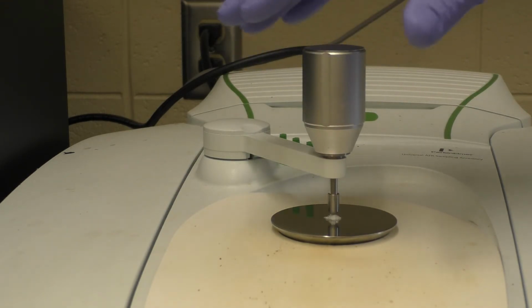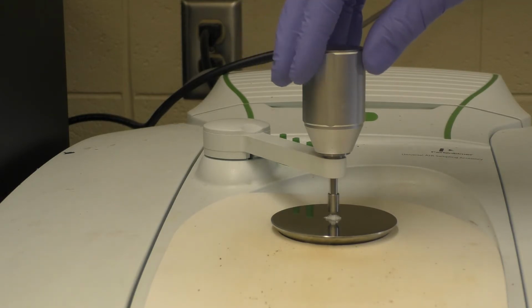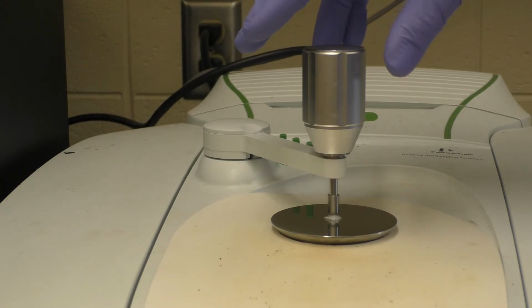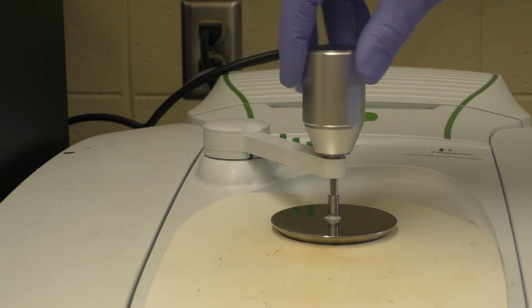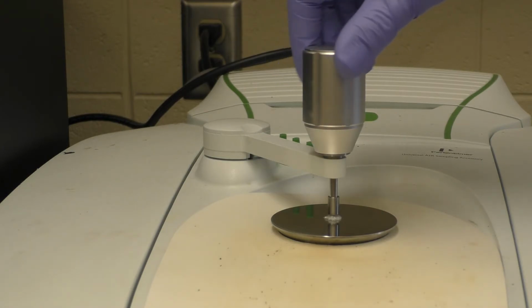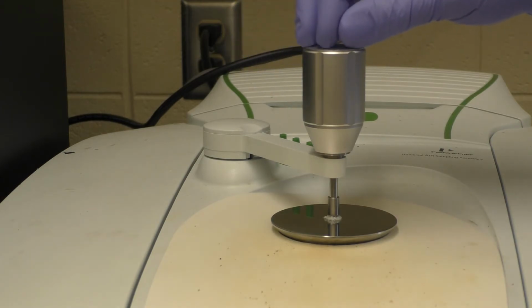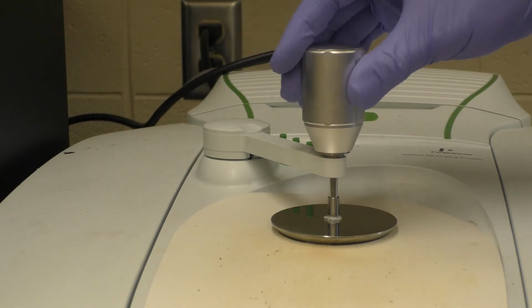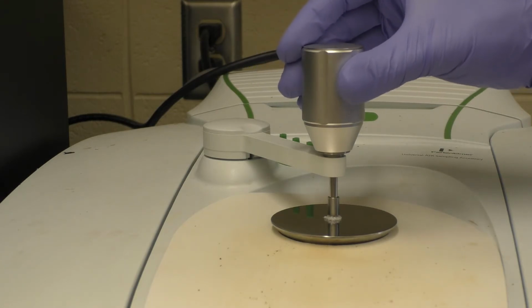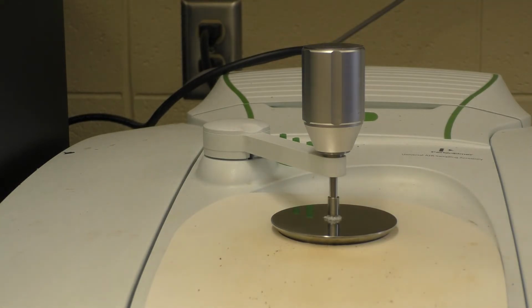Now, how far to tighten it? We don't want to tighten it too much because then we might break the sampling crystal underneath. And there is a force gauge on the computer that will help tell us how far we need to go. But generally, we keep tightening until there is a small click, which will indicate that the sampling gauge is in the right position. So we tighten it down, and then there we go. There's a small click. And now we are all set.